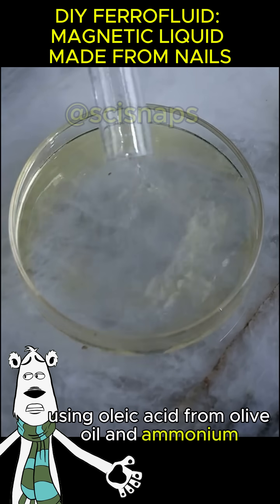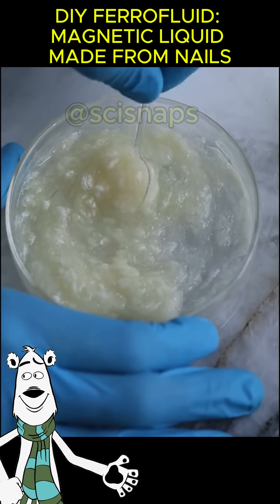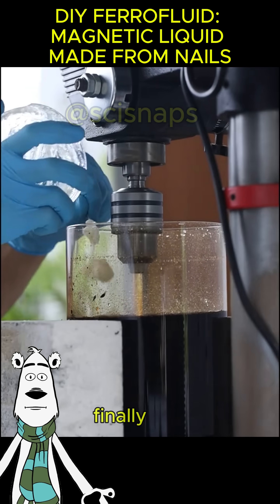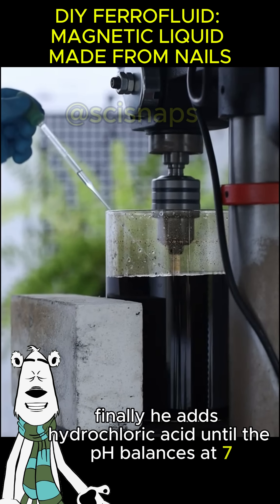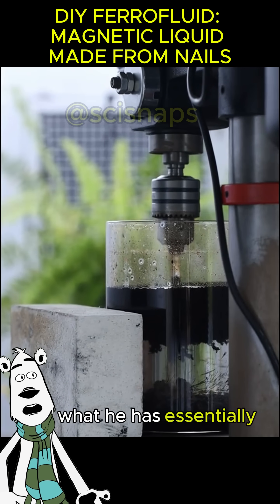This soap coats the nanoparticles, completing the base for magnetic ferrofluid. Finally, hydrochloric acid is added until the pH balances at seven, converting the soap back into oleic acid.